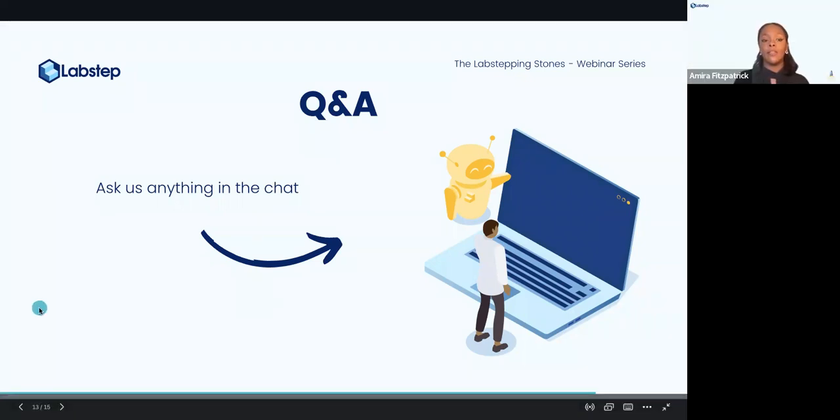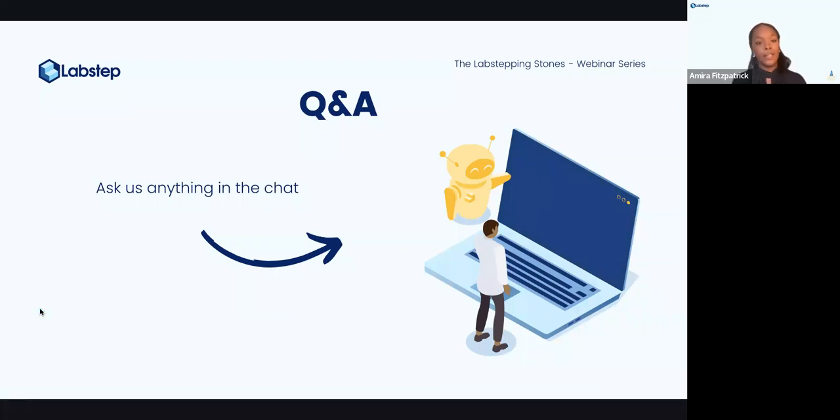If you want to pop in your query, email us at info@labstep and we'll get back to you as soon as possible. Because there are so many questions that get raised with such a flexible tool, just let us know and we'll be able to answer you. Leonard, if you're having specific problems updating the templates, that's something we can definitely help with. I'll drop you a line and we can sort out the problems you're having.